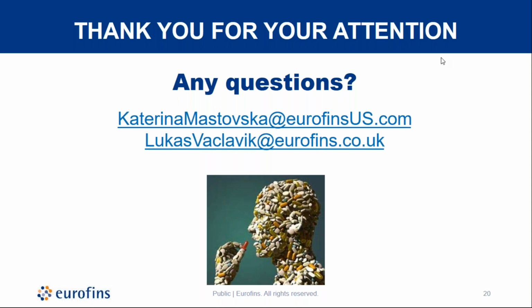I'll take this one. Yeah, the simple answer is yes, we do. In addition to what I've shown in the presentation, we do have additional multi-method that covers over 40 mycotoxins and includes also their metabolites and some alkaloids. There's a lot of compounds, but for example, we include citrinin or enniatins in this method. And last but not least, we are also able to test for ergot alkaloids.